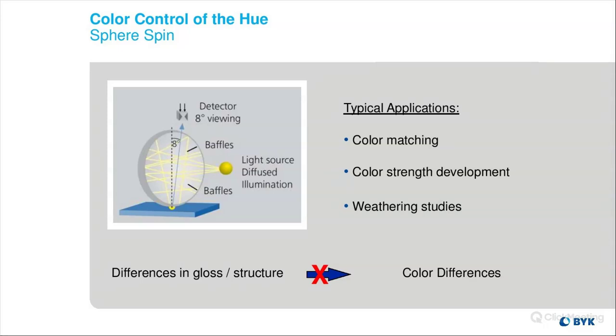So with this, we're not going to get those differences in the gloss and structure. It's not going to take into account that information. So we're just going to strictly get our color differences, our absolute color differences, purely on the pigmentation.